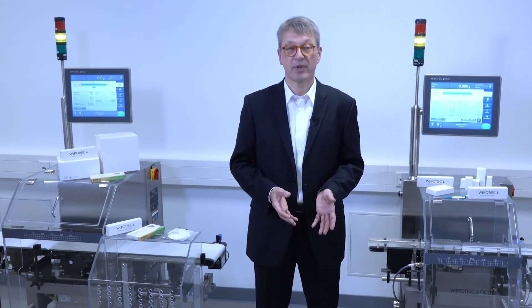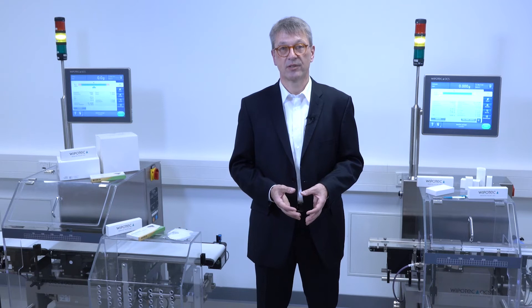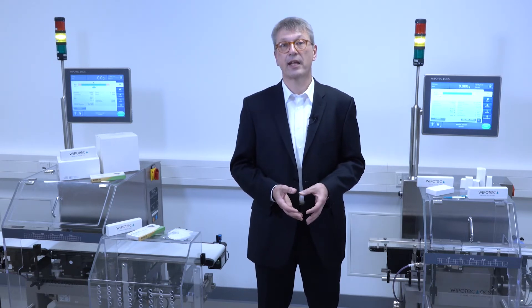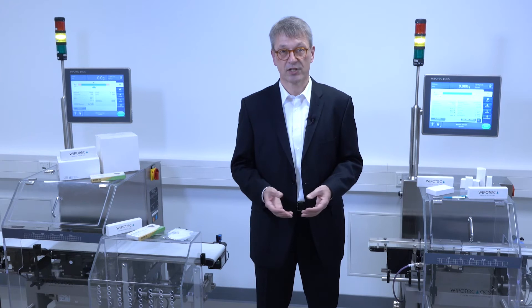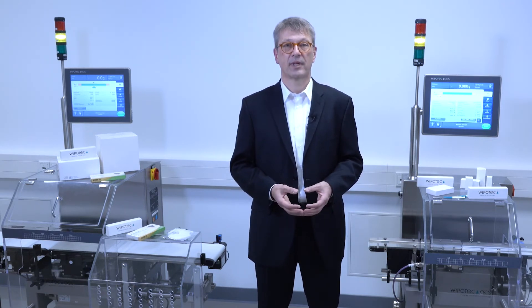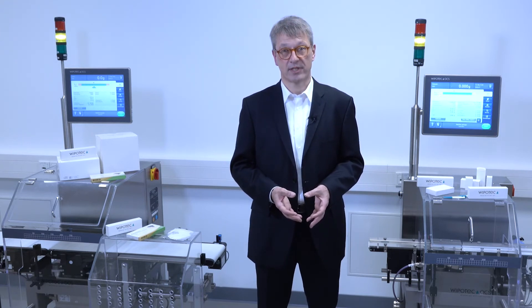Speaking about weighing and behavior of products, we also employ active vibration compensation together with the electromagnetic force restoration weigh cells. That helps to minimize influences from vibrations — building structure vibrations, machine vibrations — again implemented to achieve a better and more precise weighing result.